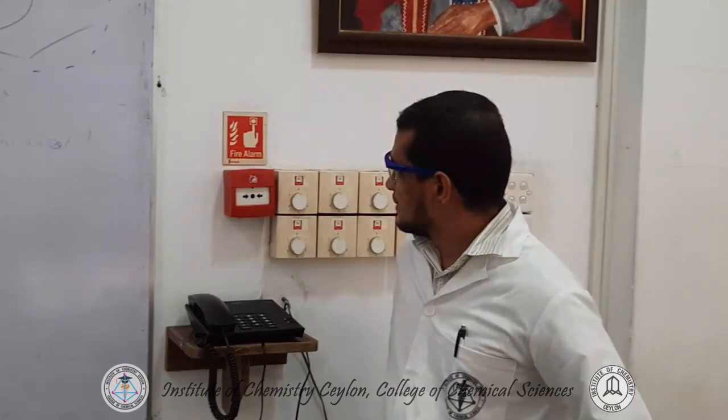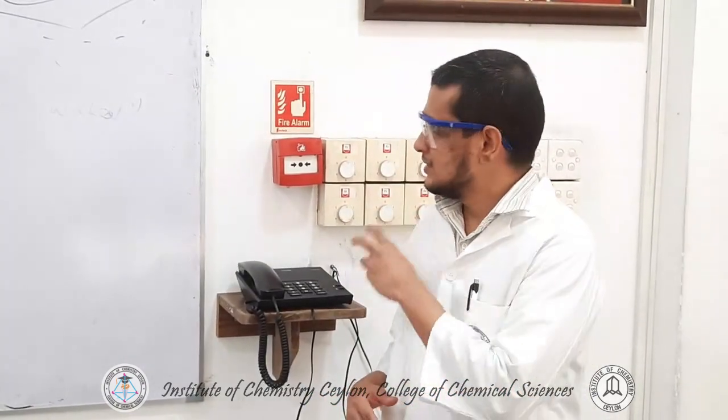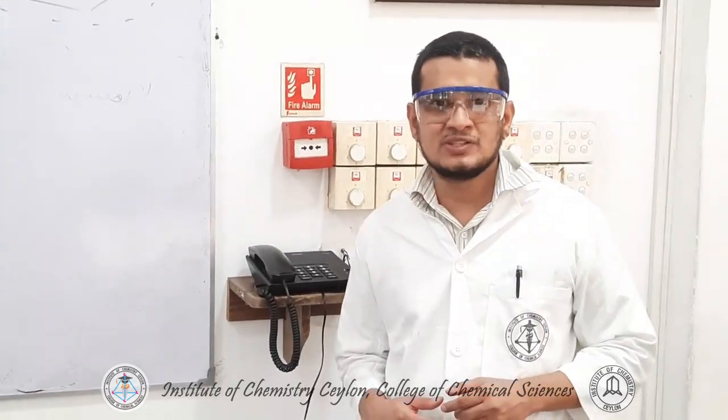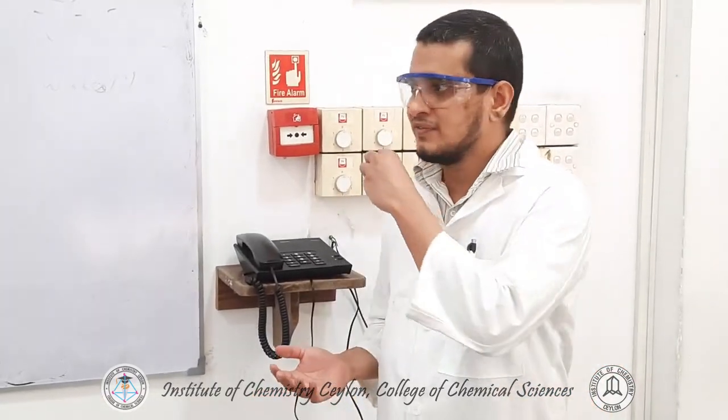Also, the laboratory is equipped with fire alarms. In case of a fire, the alarm will ring, so you know it's a fire. It doesn't matter that you may be performing the last part of a long experiment, or it can be a very important experiment for you, but remember, your life is more important than any experiment. So if you hear the noise of a fire alarm, you are supposed to go out, and we will show you the fire assembly point. So in case of a fire, or when the fire alarm is ringing, you are supposed to stop all your work and immediately evacuate from the lab and stay at the fire assembly point.